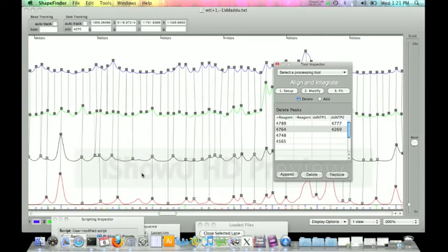This spot, now we're getting to be a little tricky. There isn't really a very well-defined shift. Sometimes nucleotides can be off by 2, maybe even 3 positions, depending on how well you do the analysis. The number of peaks is crucial, again. So what we really want to do is line up this data. We can see that we have a U here, and we have a DDA peak right here. So clearly this is our U right here, but it's off by 1 position.